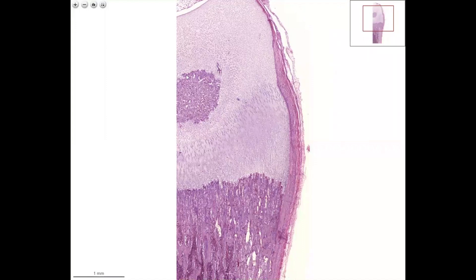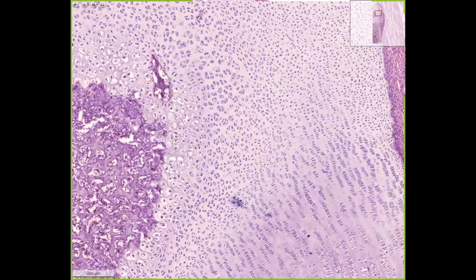In the epiphysis, you see a region for the secondary ossification center. In the vicinity of this region, we also see a layering of the cartilage cells. Here are the resting cells, and in the direction of the diaphysis you have proliferation and hypertrophy. But here you also have the proliferation, hypertrophy, and the zone of degeneration.